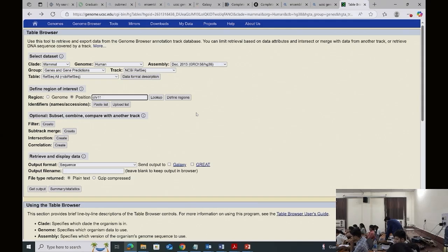And then you can scroll down, you can see the structure of the gene, 3 exons, these blocks. You have to download the data, so export data. And then FASTA sequence, all this good, so go down and it will download all this CDS, protein and everything. So then next.